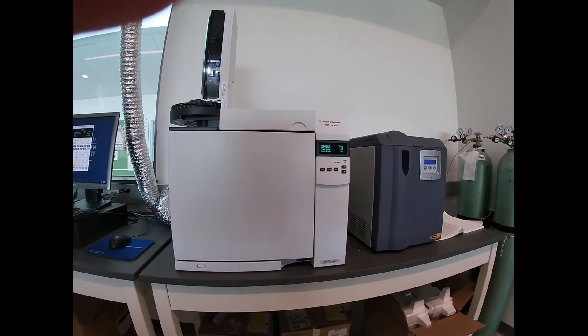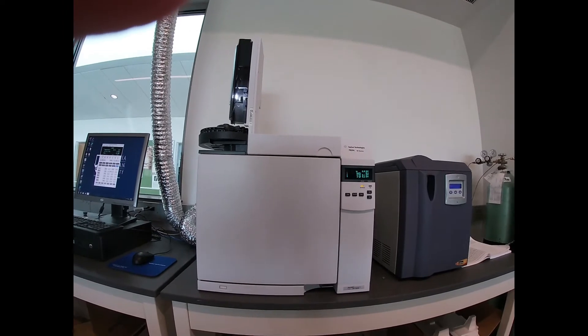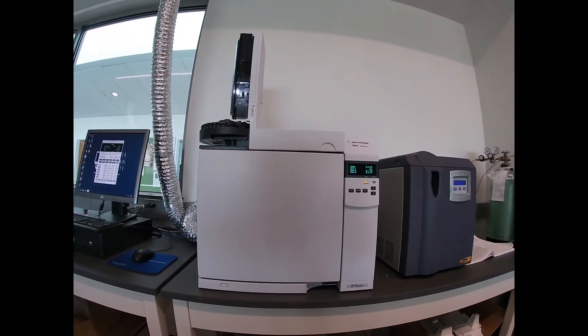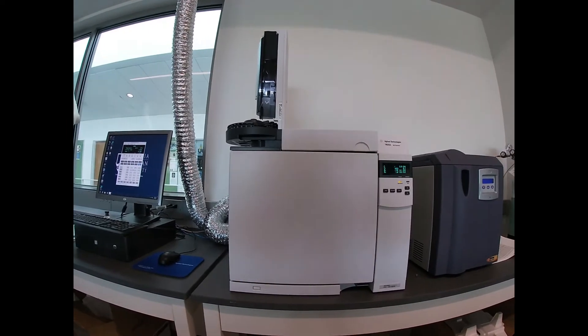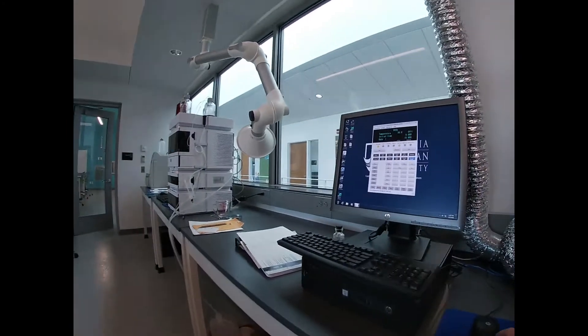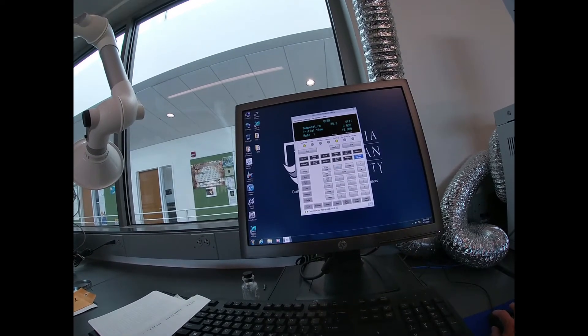So this is an Agilent 7820A GC system. This is a GC with an FID detector.